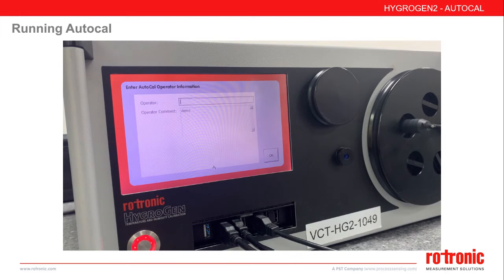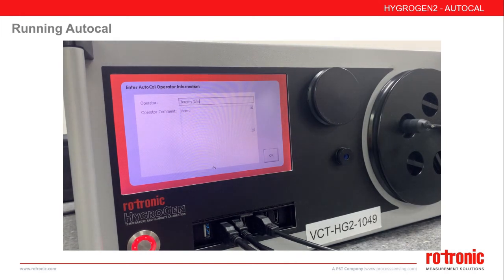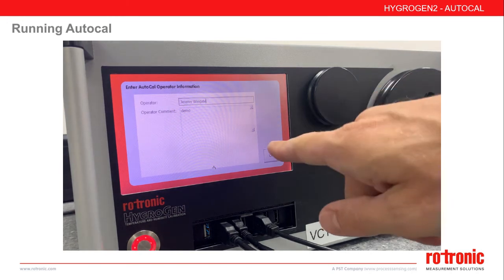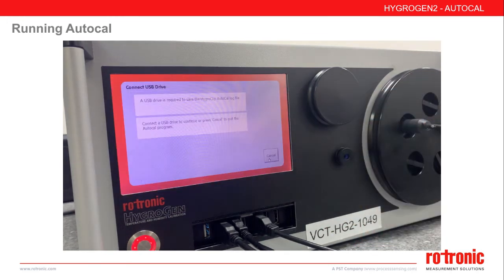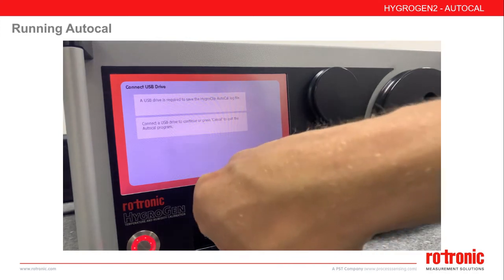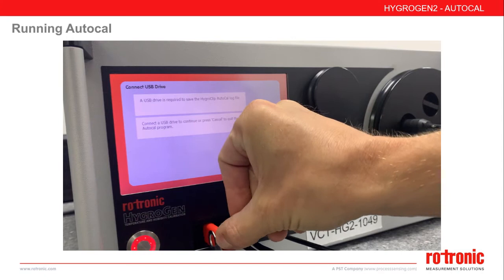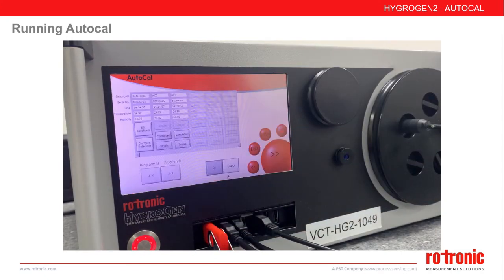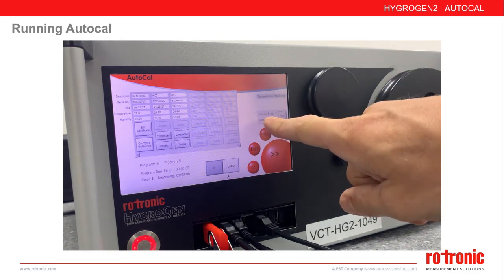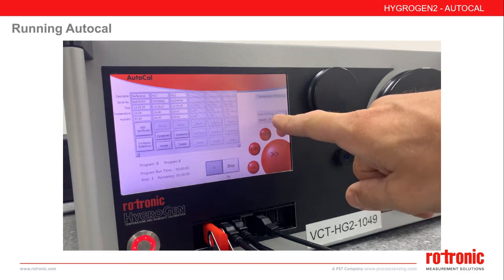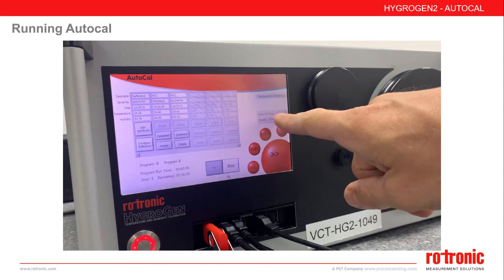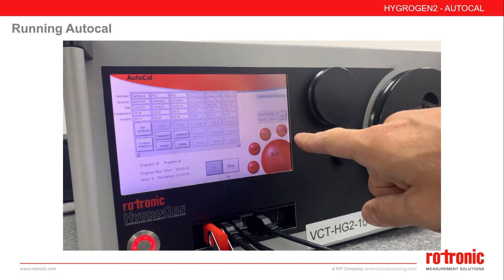You must enter an operator name, which will be included on the certificate, and you will also have the option for any operator comment. AutoCal requires a USB stick to record the information — if one is not inserted, it will prompt you. The AutoCal program will now run automatically. On all screens, you will see a small status window giving you the AutoCal program number and the elapsed time.